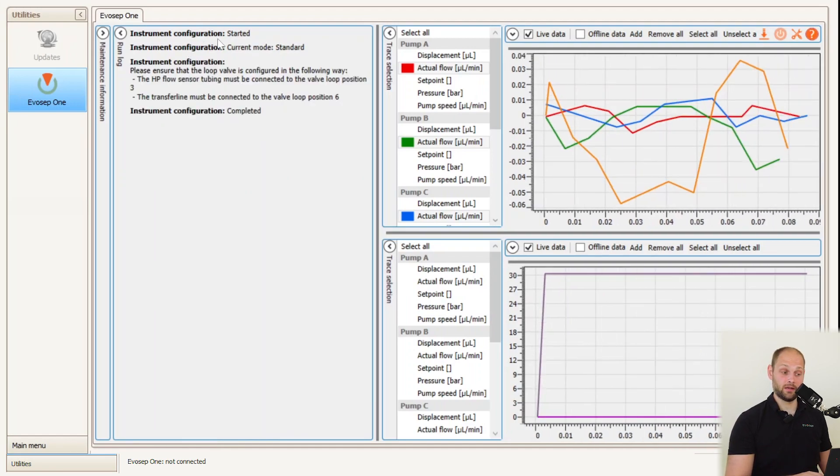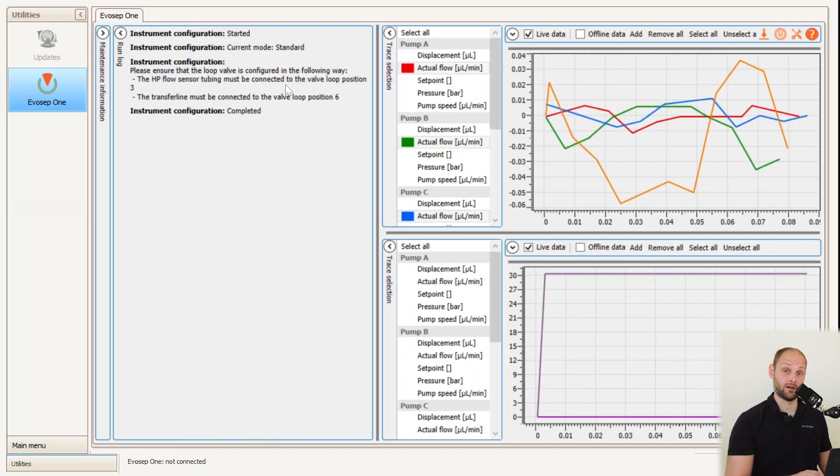With the script now successfully run, we can see that the current configuration mode is set to standard. However, we'll now need to shift it to zoom to run our new WhisperZoom methods.